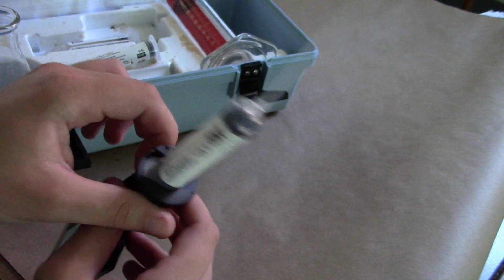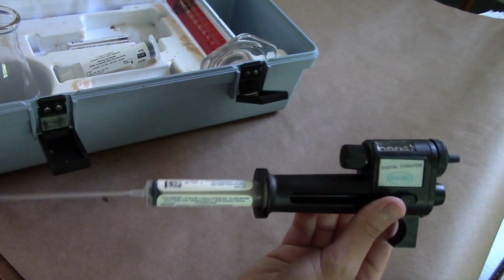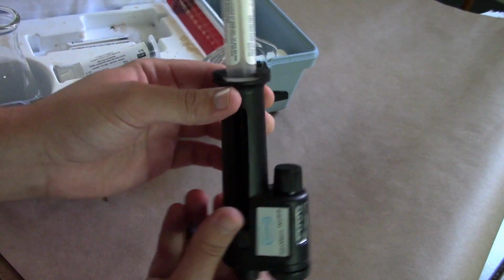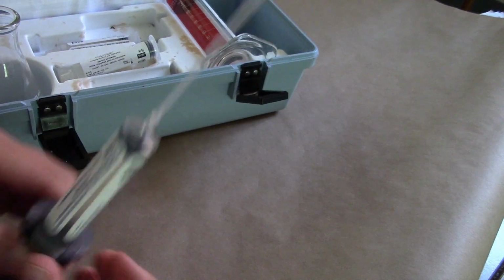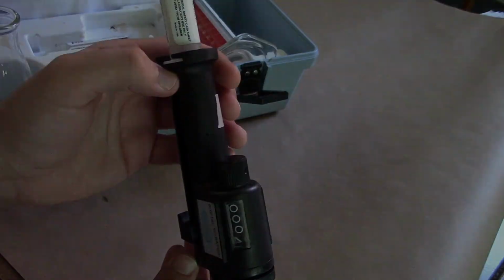Now we want to be very careful with this here because we are dealing with acid, which is a dangerous chemical. We don't want that on our skin. We don't want that anywhere near our face. So what I'm going to do is hold this upside down with this curved hook at the end. By holding it upside down like this, I'm making sure that none of it is going to spray up on me.